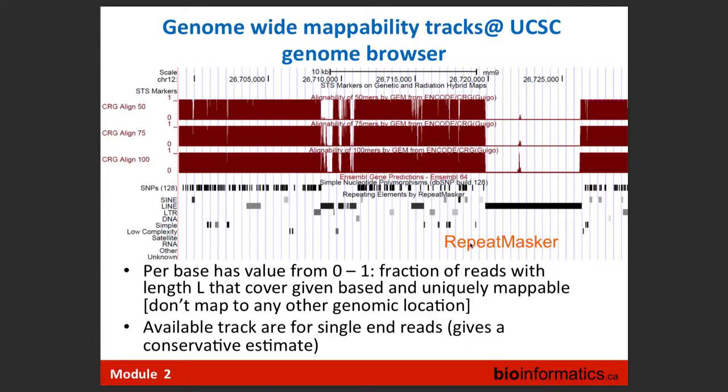Here I don't have enrichment. Maybe I have dense chromatin or something biologically meaningful. However, this hole can be just due to repeats and just due to our inability to align with short reads. So we have to be careful, we have to remember that this is possible.